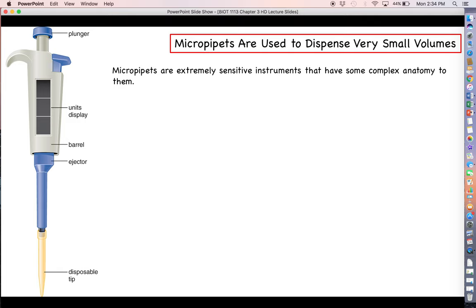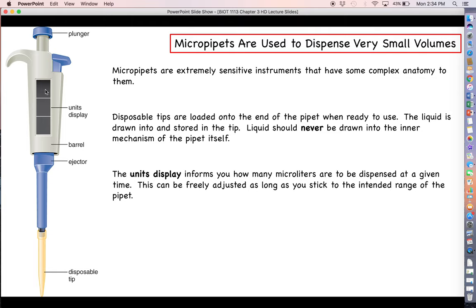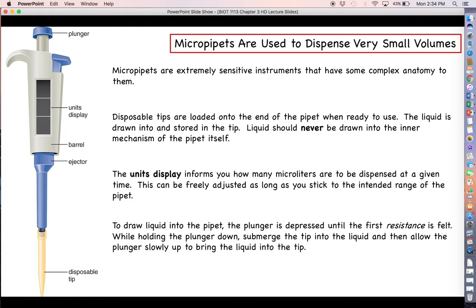Micropipettes are extremely sensitive instruments with complex internal anatomy, so we need to understand how they work to take good care of them. Disposable tips are loaded onto the end of the pipette when ready to use — these tips can be sterilized, making micropipettes useful for sterile environments. You must always use disposable tips; liquid should never be drawn directly into the inner workings of the pipette or you will ruin it. The units display — three boxes — shows how many microliters are set to be dispensed, and this can be freely adjusted using a dial on the pipette.